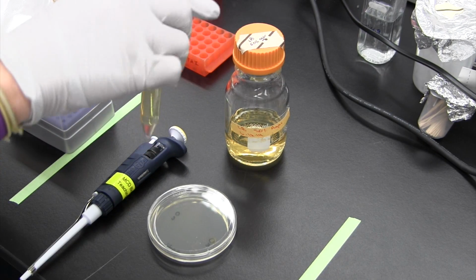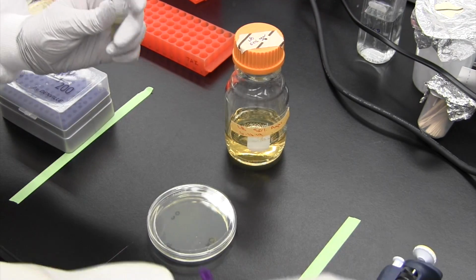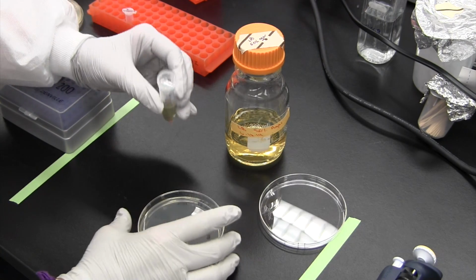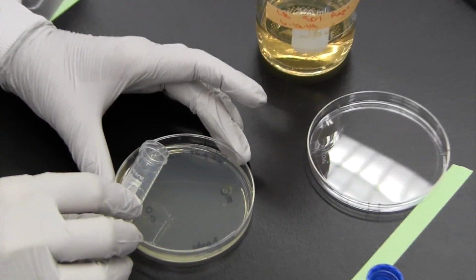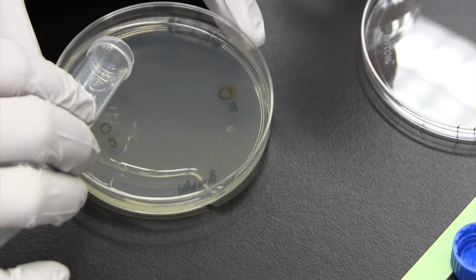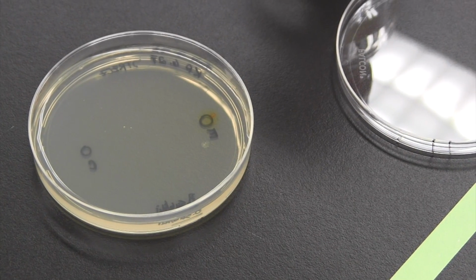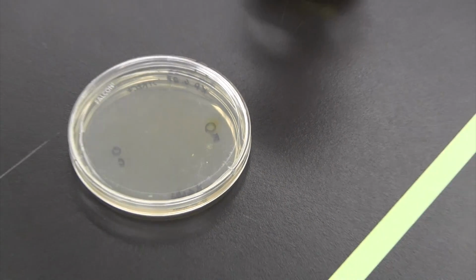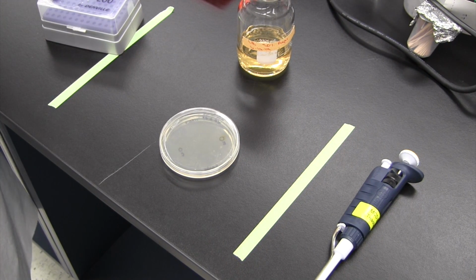Okay, I'm going to give that a vortex. And then what you want to do is pour this quickly onto the plate, not on either area where the extract is, and then quickly tilt it so that it covers the whole surface area of your plate, just like that. Then you don't want to disturb the plate. You want to let this solidify in place, for about 5 minutes for sure. Once that agar has solidified, you can then incubate at whatever temperature you've been maintaining your cultures at.